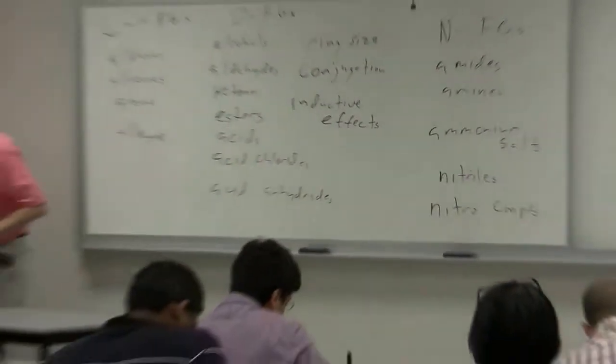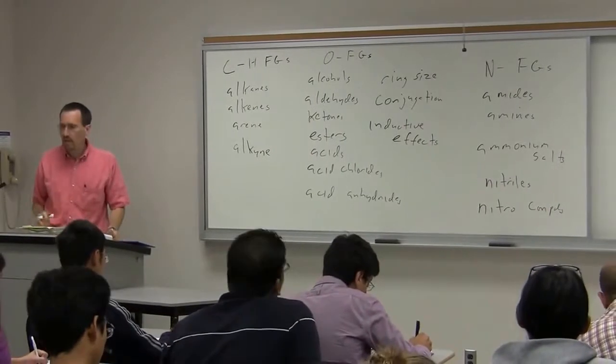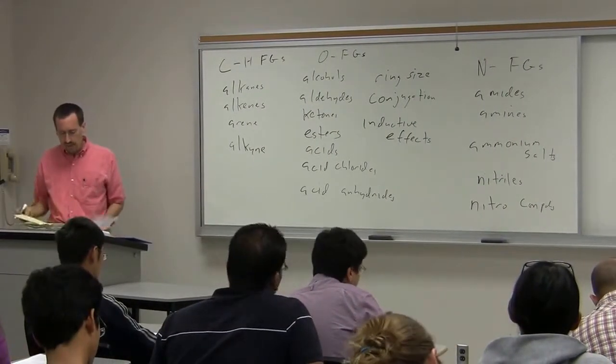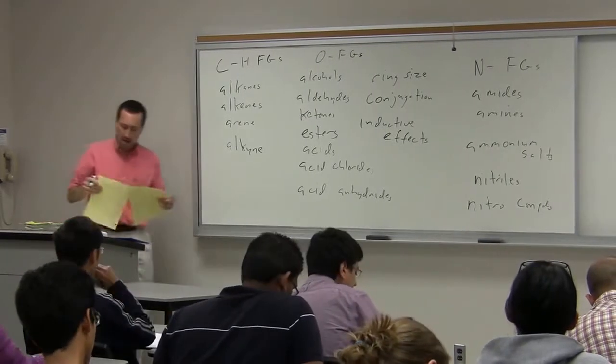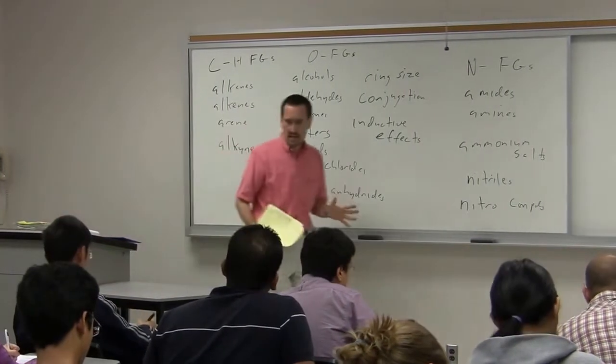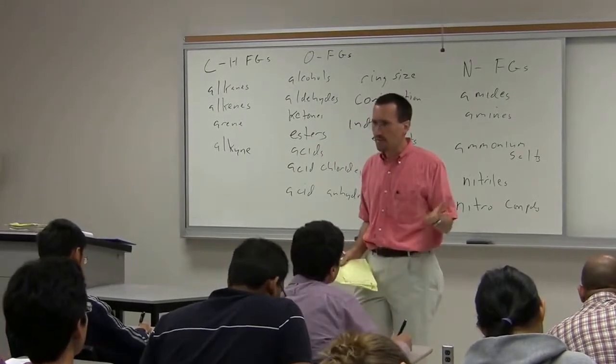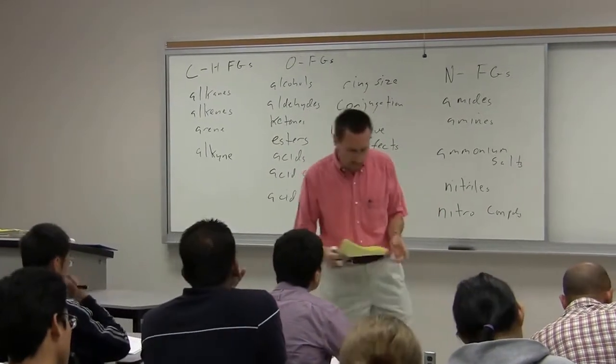So one of the things I'm going to urge you to do when you look at an IR spectrum is really to learn to read the IR spectrum. So let me give you my take, because part of reading is not just sitting and tabulating every peak, it's knowing what's important.